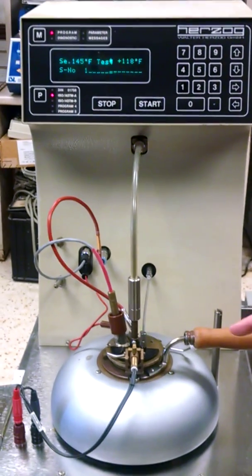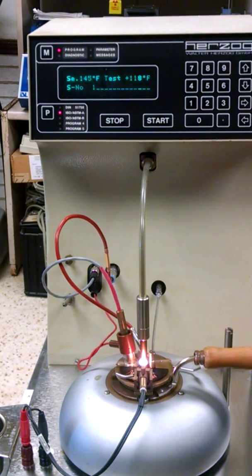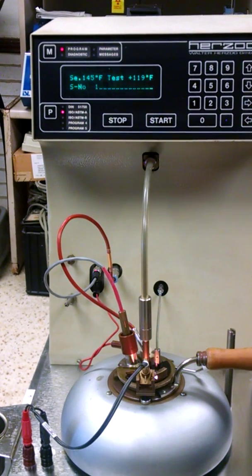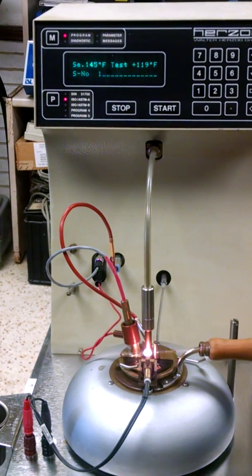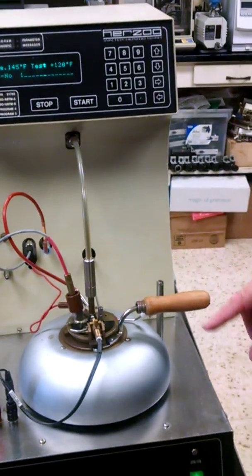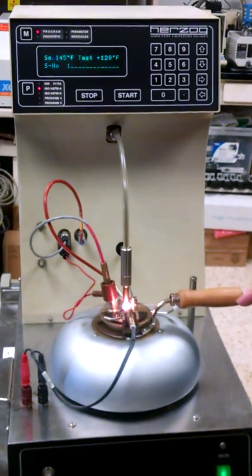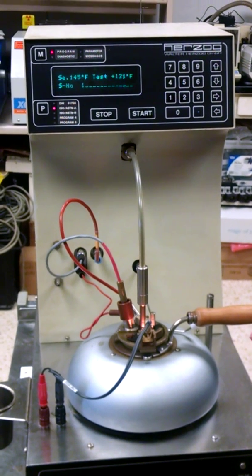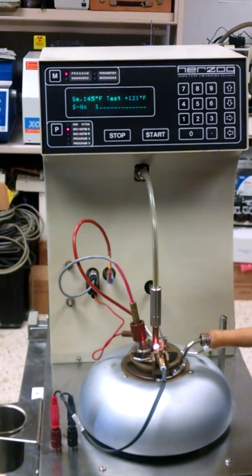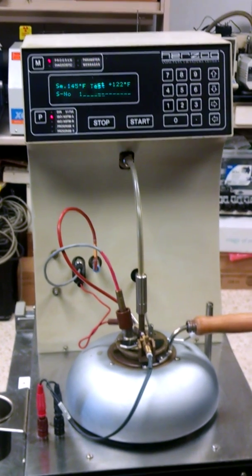The nice thing about this, this is not a gas flame. This is an electric flame. So some of your manual flash point testers, you have to use gas. And it's a little gas flame that dips down in it. Which you really don't want open flame in a lot of labs. So this is nice. It's not an open flame. It's an electric flame. The heat is electric. So you don't have any gas except for your sample.